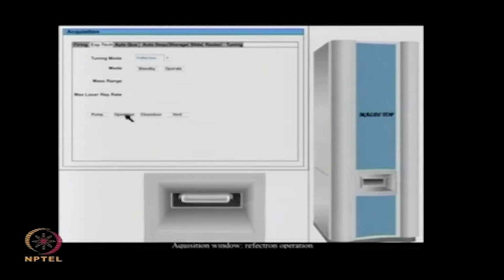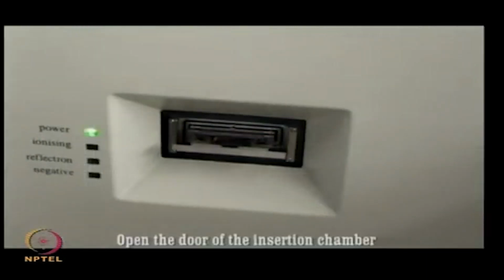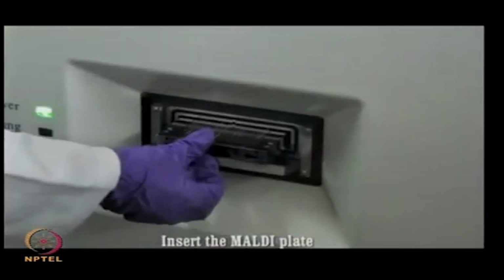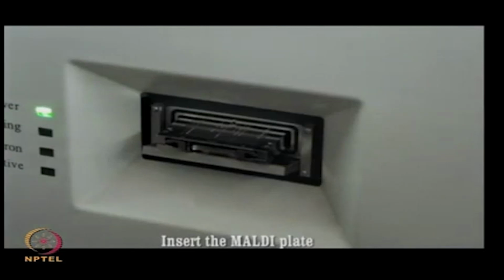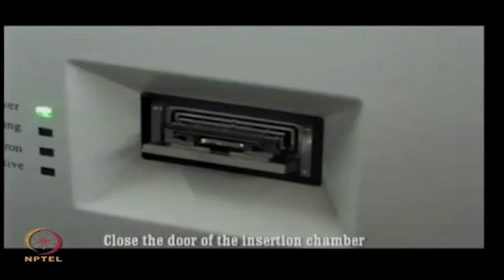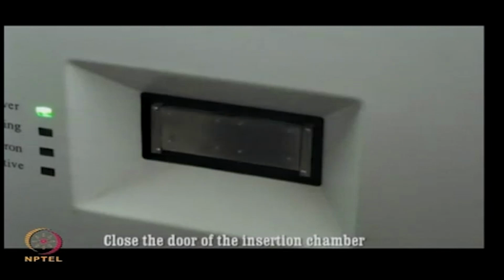So, click on the software and open the acquisition window, and then click on the open door. Insert the MALDI target plate, face up with the cutoff corner to the front, and now by using the software, close the door. The door of the insertion chamber is now closed.